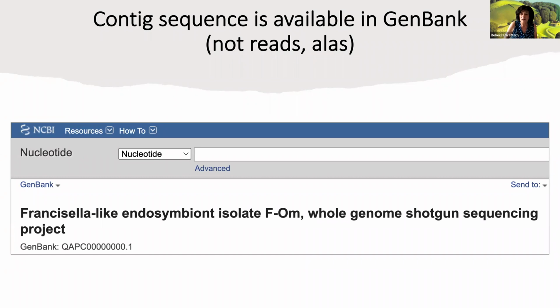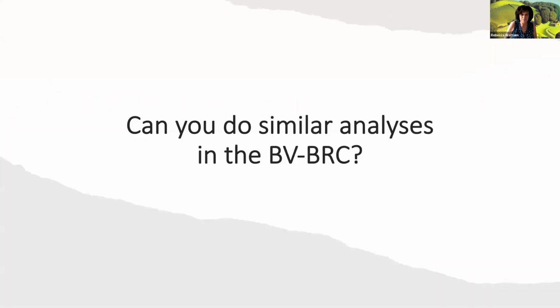They put the contigs in GenBank, not the reads, alas, because I wanted to show you an end-to-end analysis that you could do with this data, but we have what we have, and it was good of them to put it here. So we have the contigs.